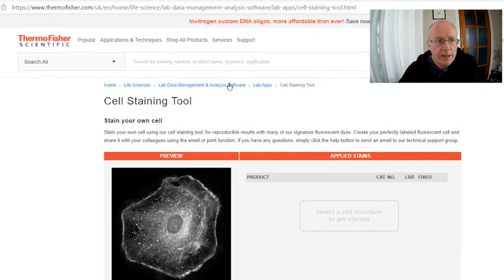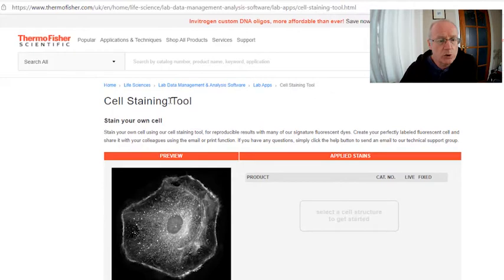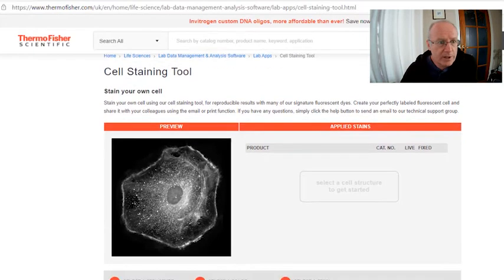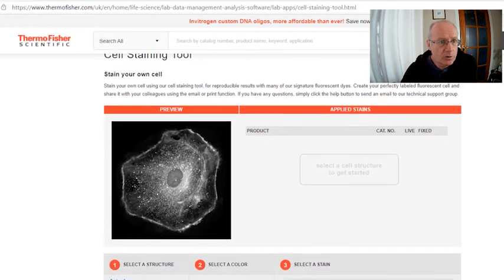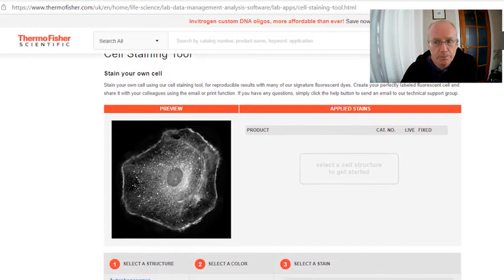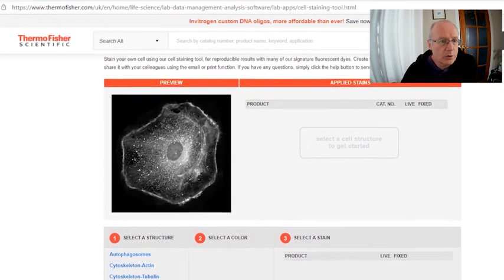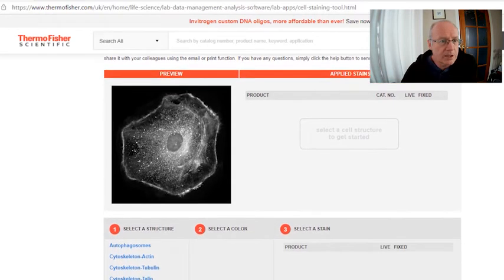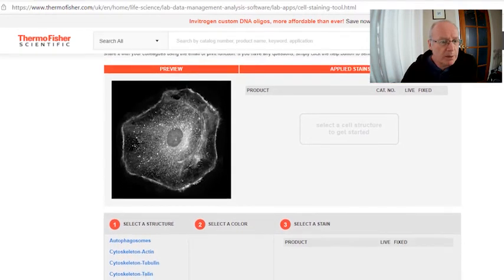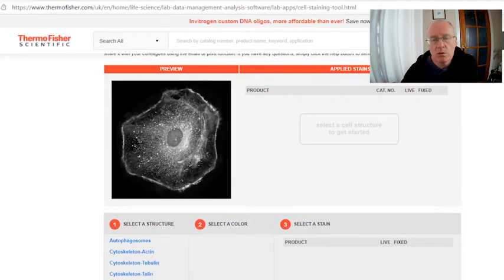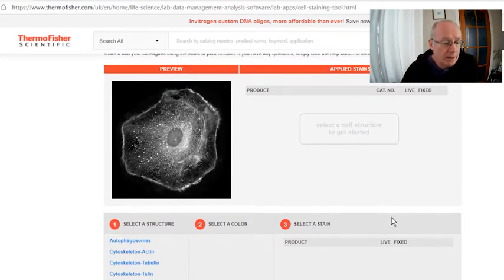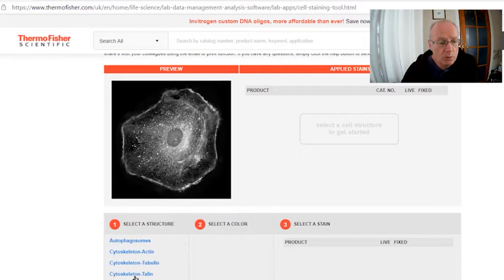So let's have a look at the cell staining tool. If you do a web search for Thermo Fisher Scientific Cell Staining Tool, you'll find this very useful tool. So what do we want to do? Well, let's just start by picking a few fluorescent probes almost at random.